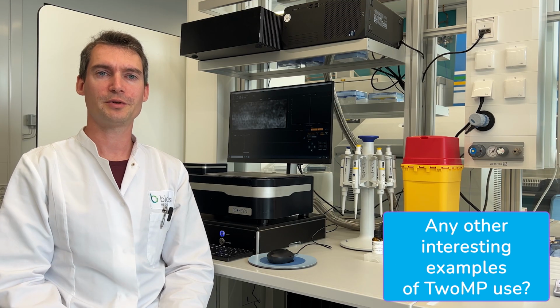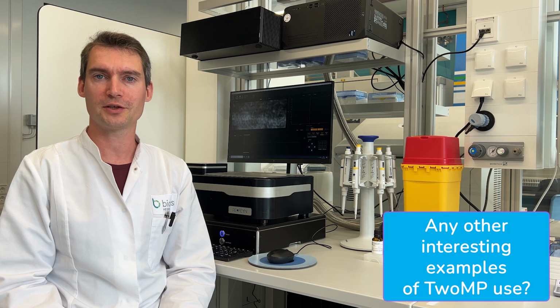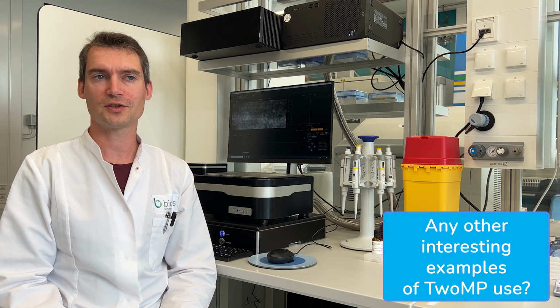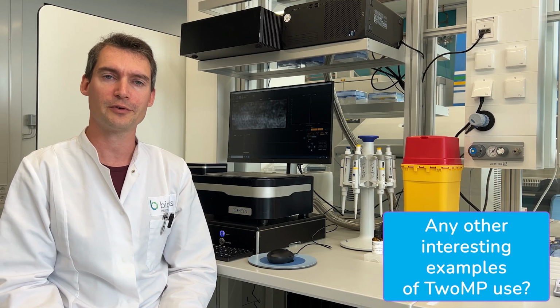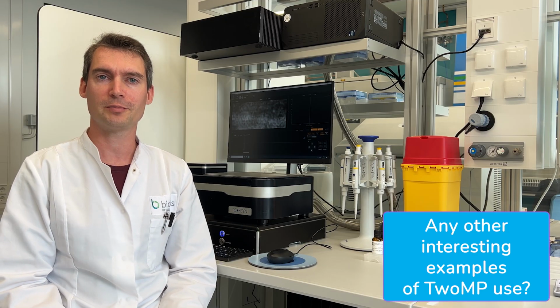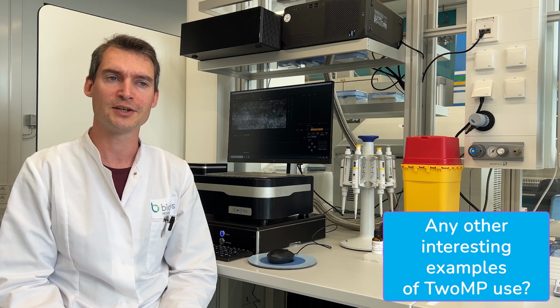Yes, that was my PhD project. My neighboring group had a device already years ago, and I used it to analyze my membrane protein. We had a bit of an issue there that it did crystallize surprisingly well. However, we only ever got the partial structure out of it. And there was a big debate on whether or not the protein was fragmenting before it crystallized.